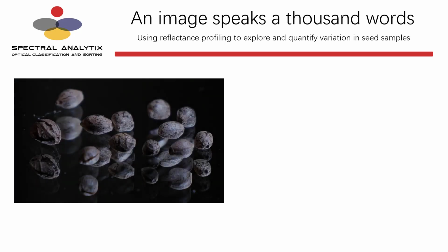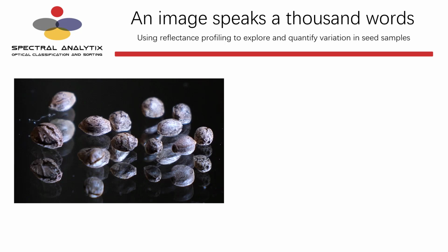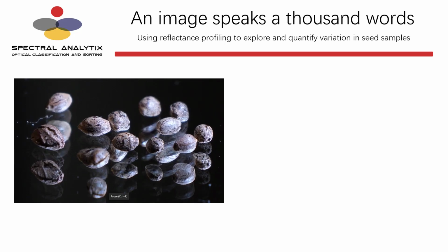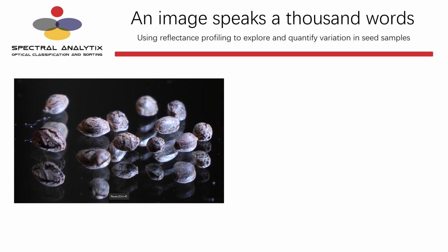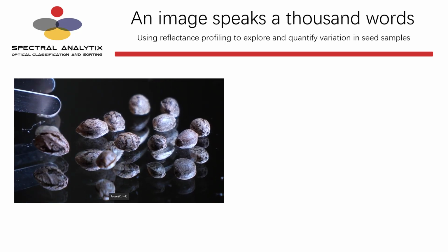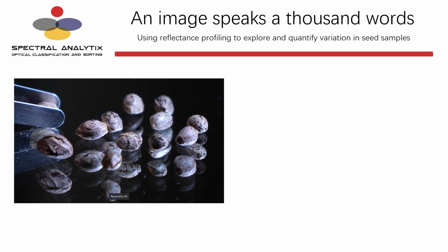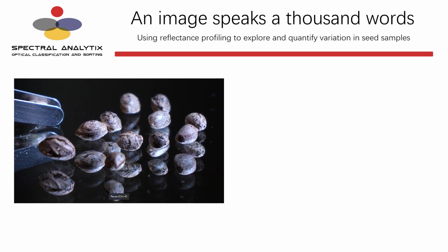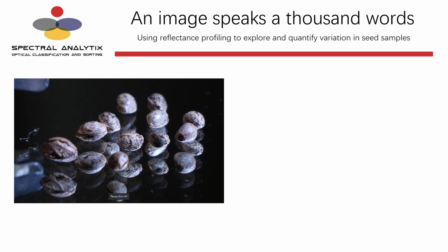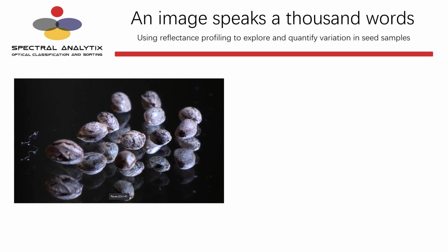Hidden under the seed coat are all the resources and the DNA coding to start the life of a new plant. The healthier a seed is, the more likely a vigorous plant will develop. And seeds within a sample are very similar but also slightly different. How and why are seeds within a sample slightly different? How to select the seeds that will yield plants with desired phenotypic traits?